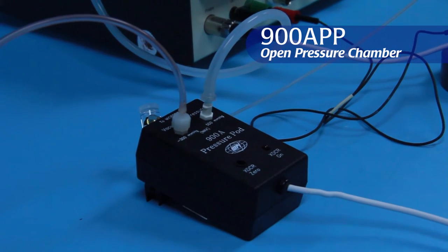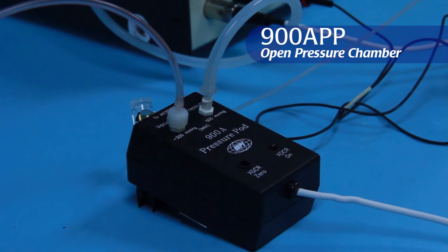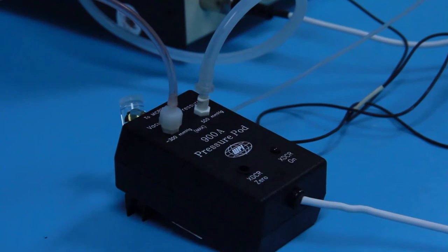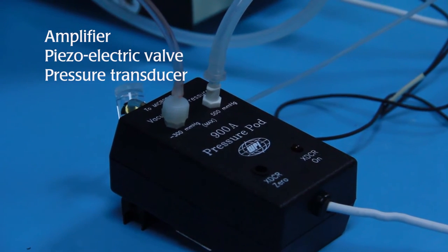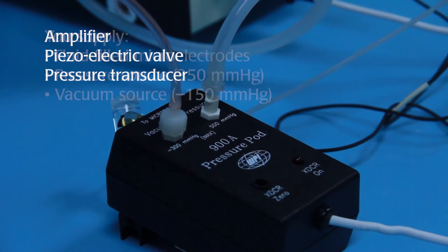The open pressure chamber is almost immune to vibrations and movements and unless they are extremely large, the open surface is unaffected by leaks. The pressure controller includes an amplifier, a piezoelectric valve, and a pressure transducer.